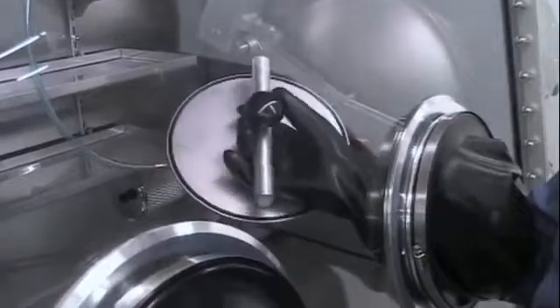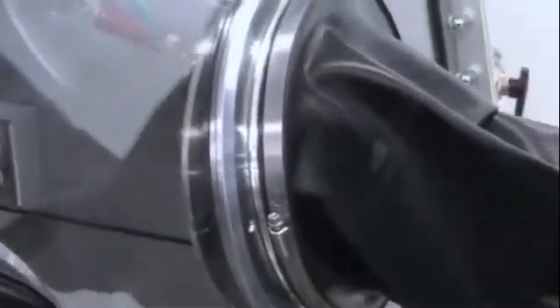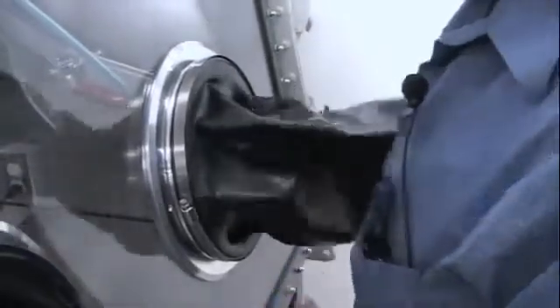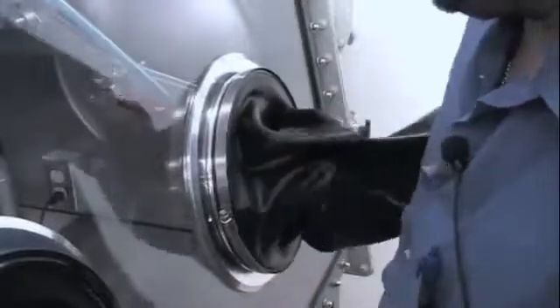To begin, we want to turn the knob counterclockwise so that the bar and the nylon tips fully latch and engage on the outer rim of the glove port. We then want to turn the knob clockwise so that we can begin pulling the back plate and the o-ring up against the back of the glove port so that it creates a good seal.